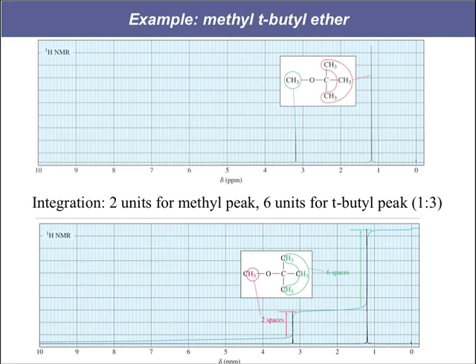So here's methyl T-butyl ether. We've got an ether with a methyl on one side, a T-butyl on the other.